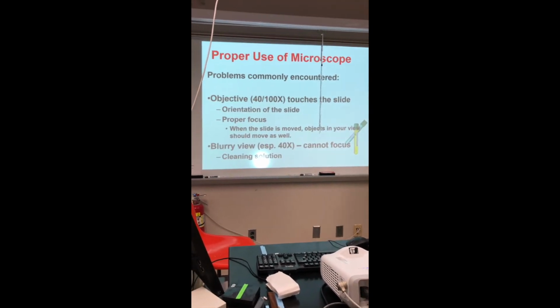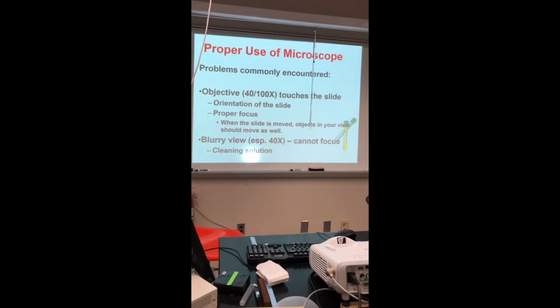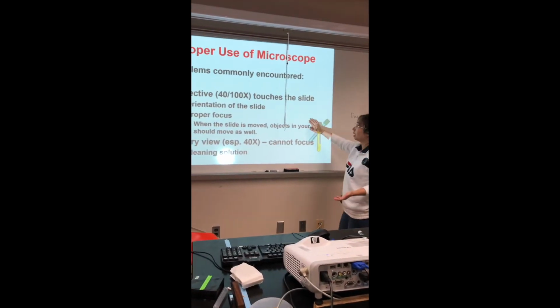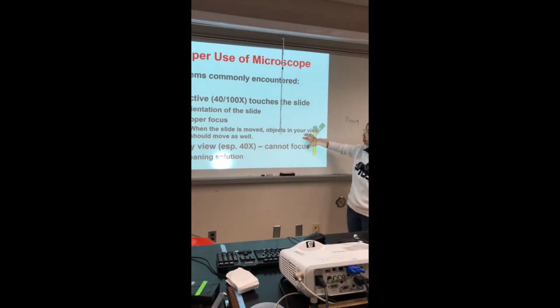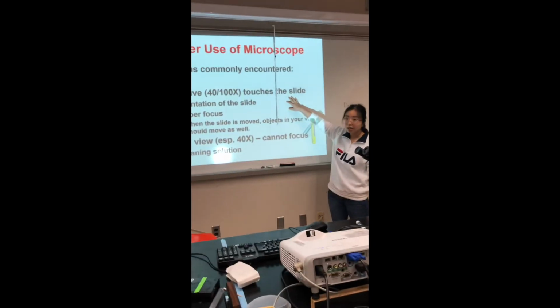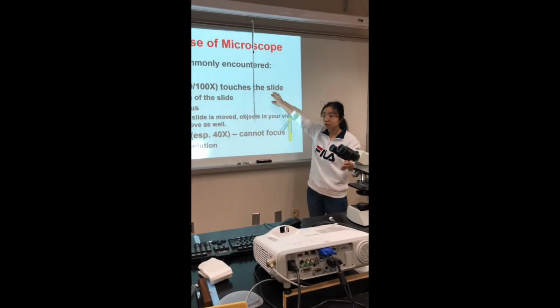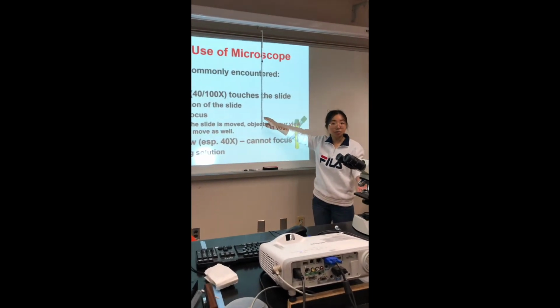Sometimes you have problems. You say, well, why can't I focus the image? There are some issues. Probably your 40 times or 100 times touches the slide. That is the issue you should avoid. Also check the orientation of the slide, which side is the correct side.